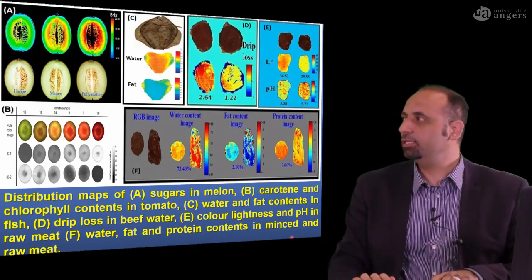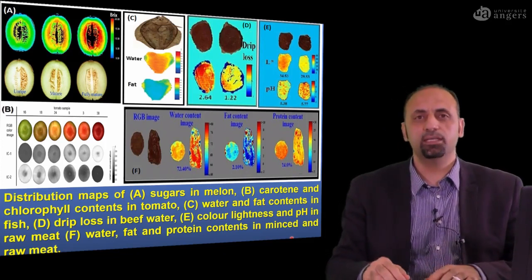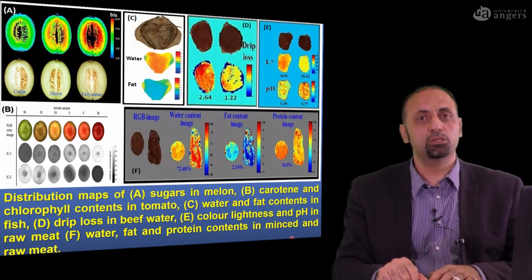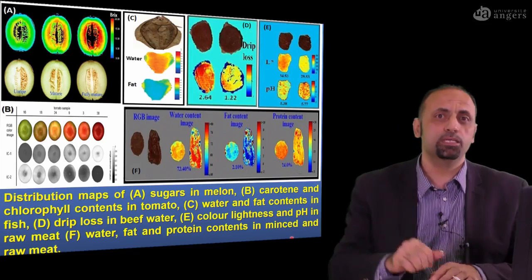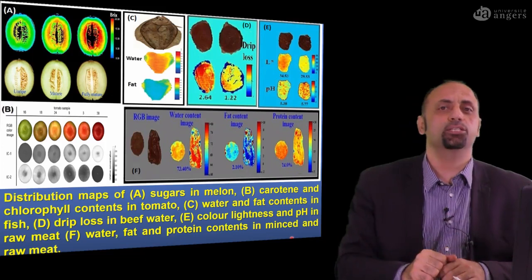A lot of applications are available using multispectral imaging and hyperspectral imaging, but there is another technology we didn't speak about. It's called illumination-based multispectral imaging. We are going to speak about this technology in more detail in the next session. See you.